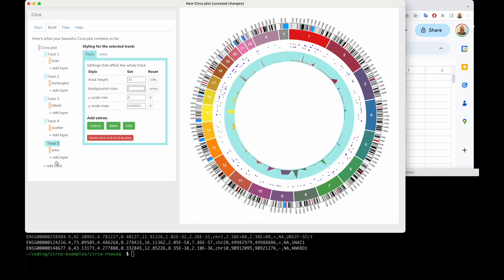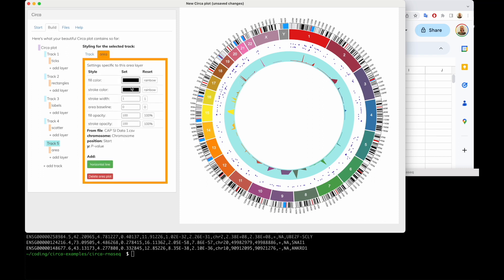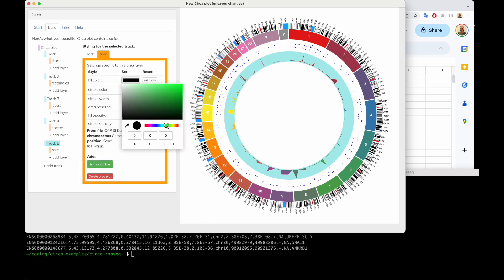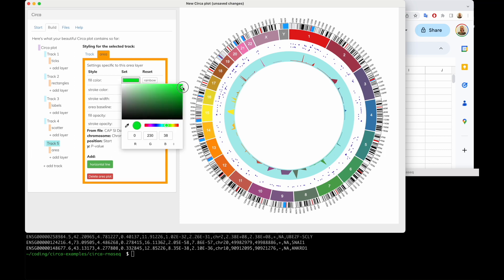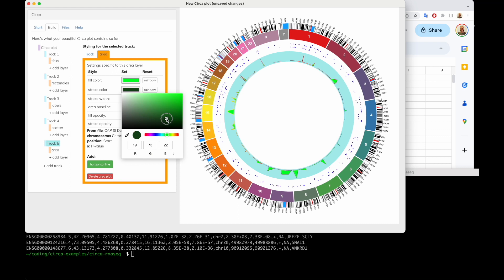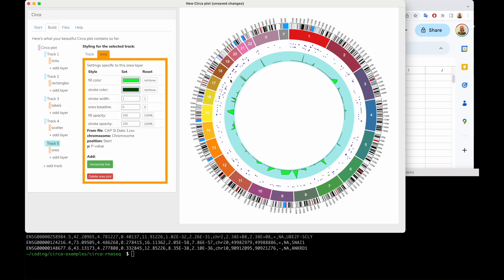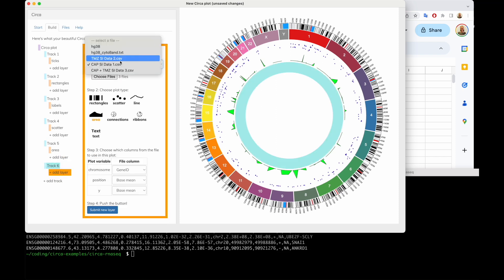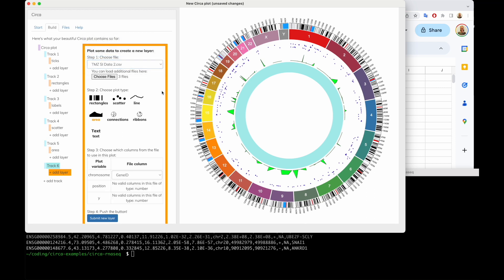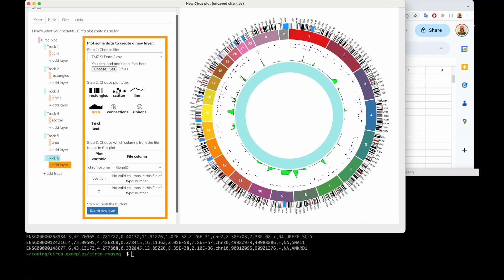I can give that a different color. Let's say I want it to be a nice gross green, with slightly darker green outlines. Now let's go and load the second dataset, TMZ. So we choose that file.